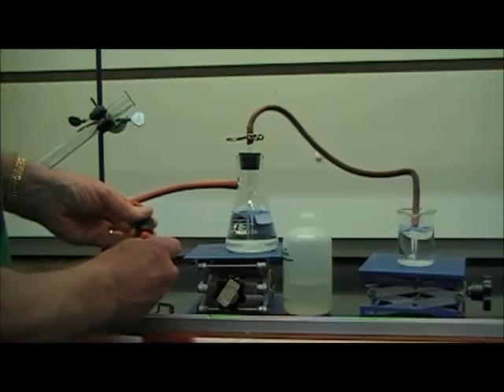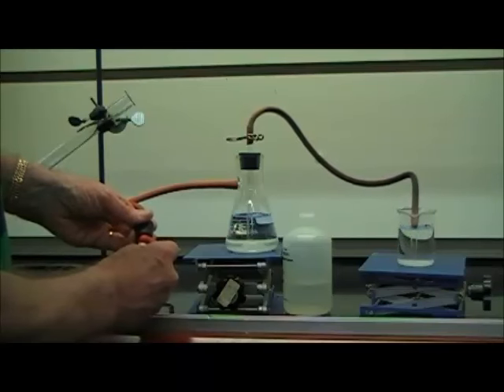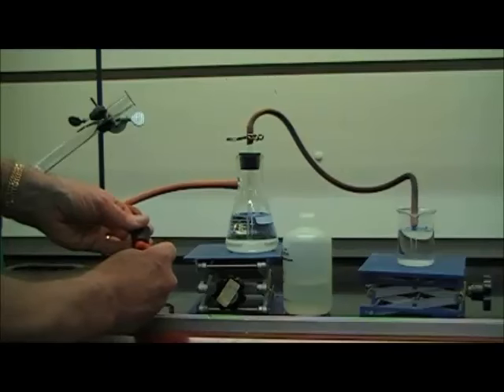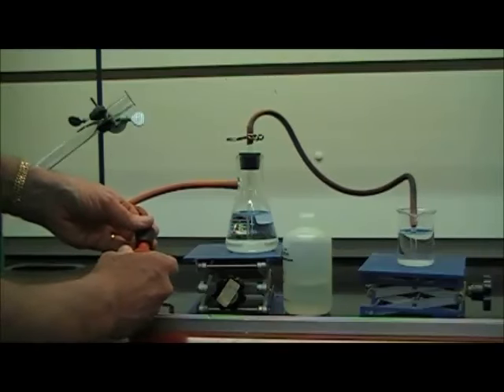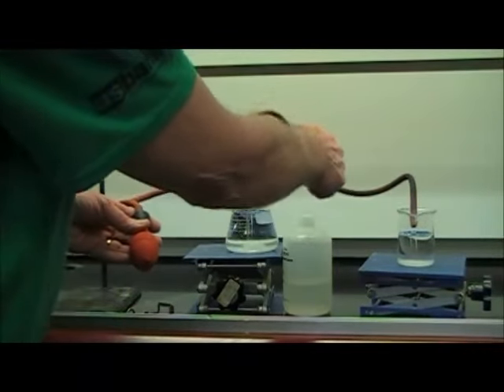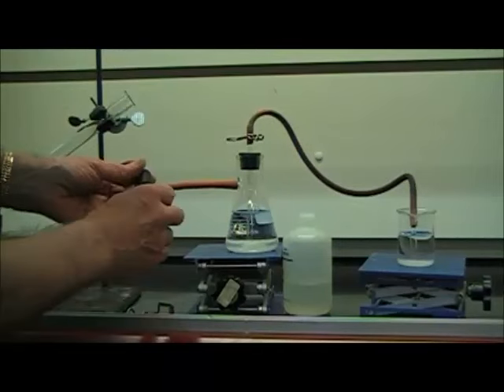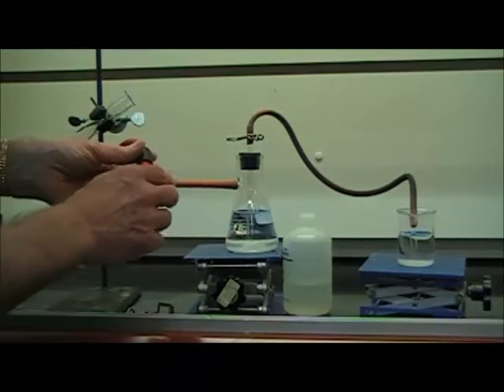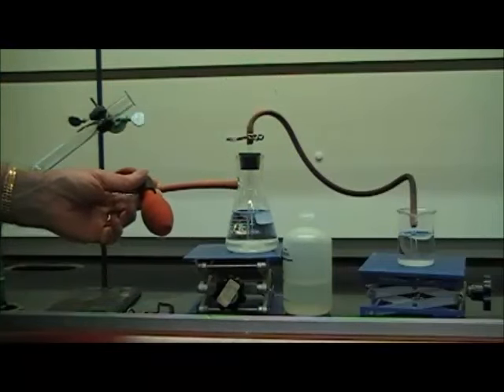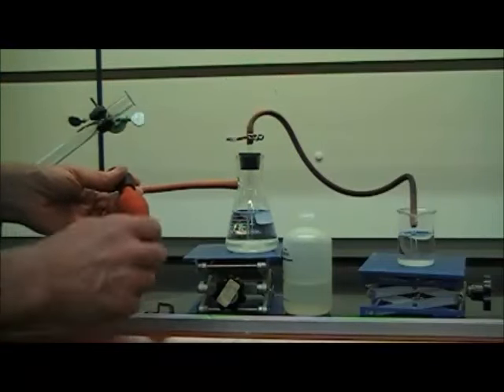And I'm going to start blowing water over towards that side and then suctioning it back over towards this side. And notice that there's some bubbles initially, but once we've established a complete water bridge from one side to the other, then there's no air bubbles trapped in here, and it's completely filled with water all the way along. Okay. If I were to take the bulb off of here, then water would siphon in one way or the other, because by establishing that water bridge, we've established a siphon.